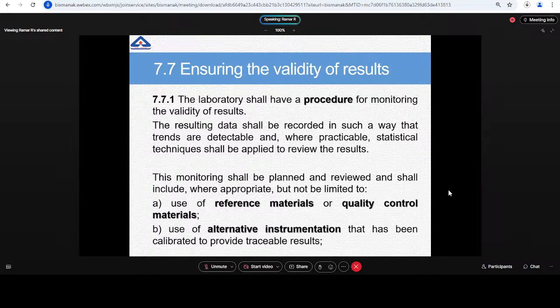The reason why we are going on is that, depending on the concentration level, the criteria may be different. For example, at the purity level, the percentage level, an error of only 2% is allowed. In the case of a microgram level, even 25-30% of error is allowed. So for that reason, you can use Horwitz's equation. For each and every concentration level, you will get different acceptance criteria.